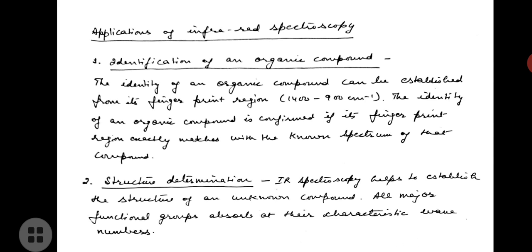The next application is structure determination. This technique helps to establish the structure of an unknown compound. All major functional groups absorb at their characteristic wave numbers.